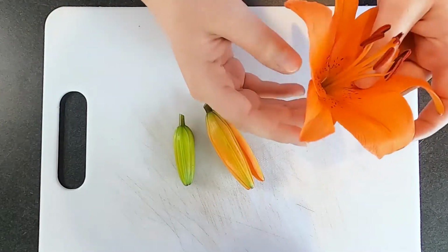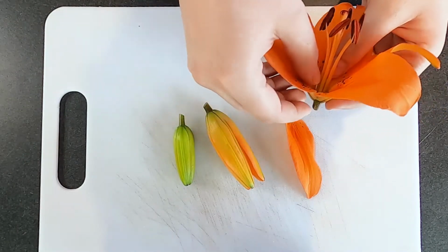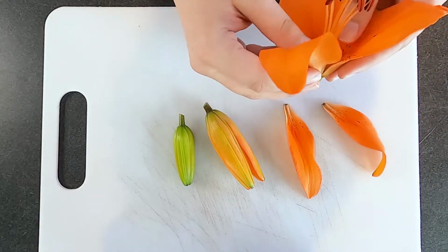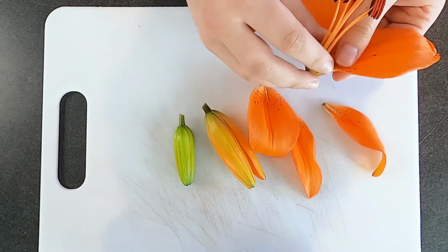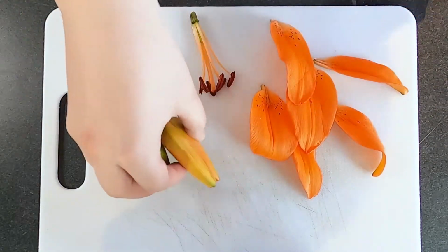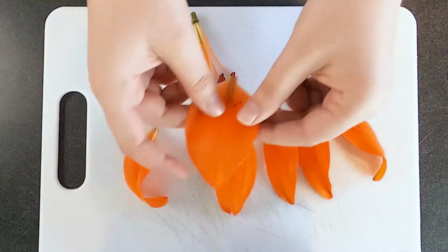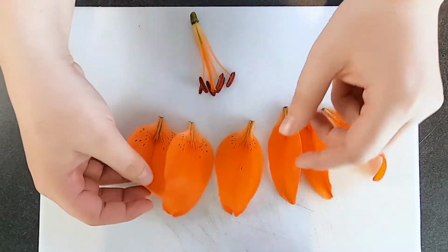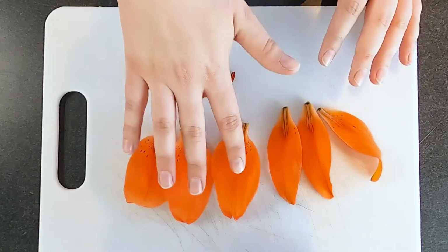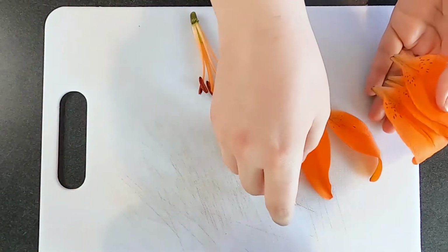So what we're going to do is I'm going to take apart some of these sepals and some of these petals so we can get a closer look at what all these petals look like. So I'm just going to put these away. So now we have all these nice, here are my sepals and here are my petals. You can kind of see a little bit of a difference here. So these ones are a little bit thinner and these ones are a little bit thicker. So these are our petals and these are our sepals. I'm going to put these away.